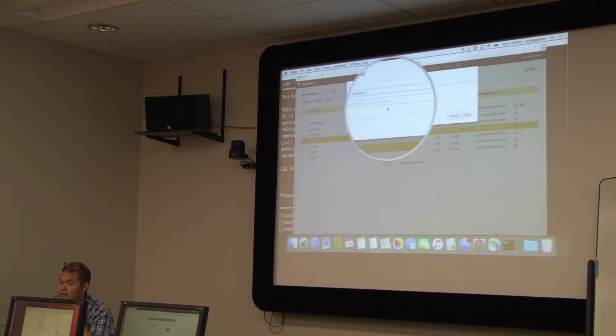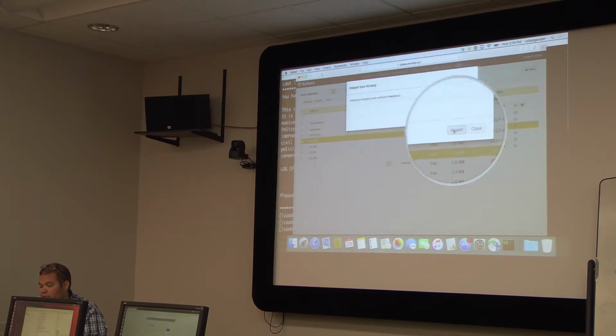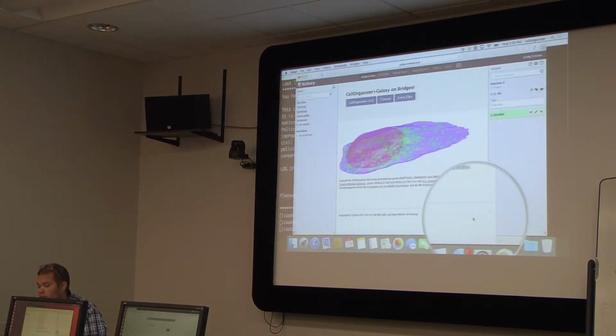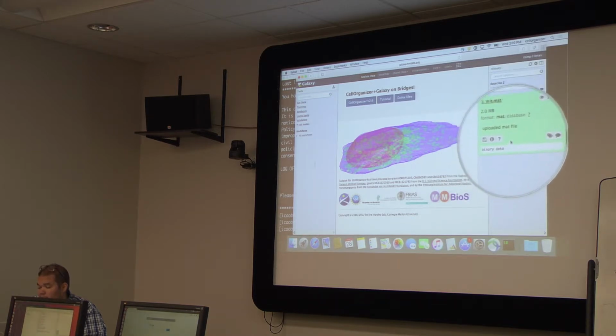Okay, one thing I want to be clear about before running it right now. Last year we showed the demos. I don't know, were any of you here last year or not? No one? Okay. So the demos in CellOrganizer are seeded, so you're guaranteed to get the same result every time that you run it. But these are not, meaning that even if we train on the same model, each of us should get a different image. Okay? So I'm going to import it. Select dataset, click, and it's going to take me back.